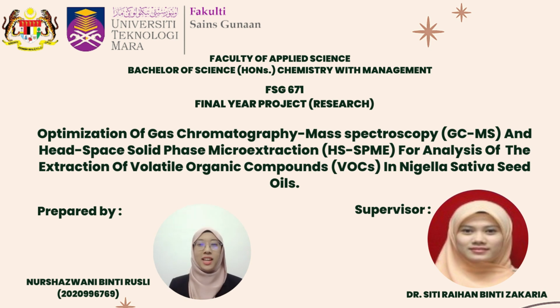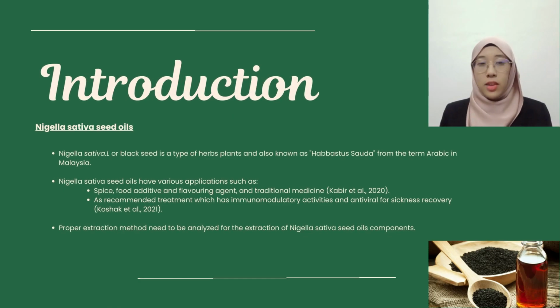I'll be presenting my final year project entitled Optimization of Gas Chromatography-Mass Spectroscopy (GCMS) and Headspace Solid Phase Microextraction (SPME) for the analysis of the extraction of volatile organic compounds in Nigella Sativa seed oil, under the supervision of Dr. Siti Raihan Binti Zakaria. What is Nigella Sativa seed oil?